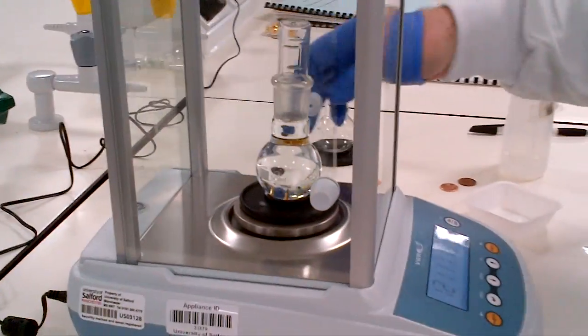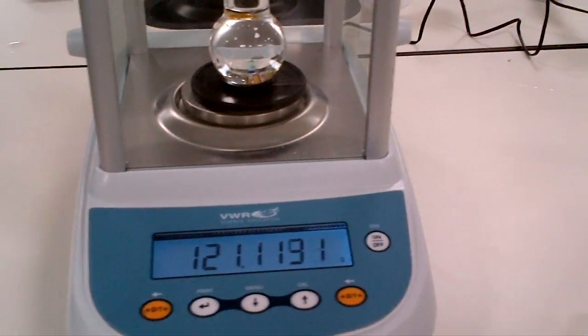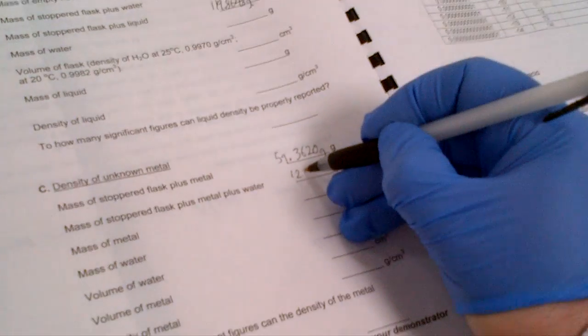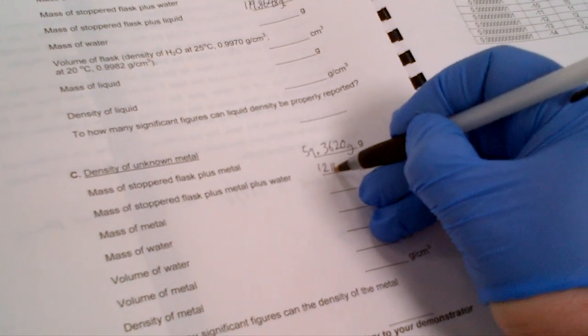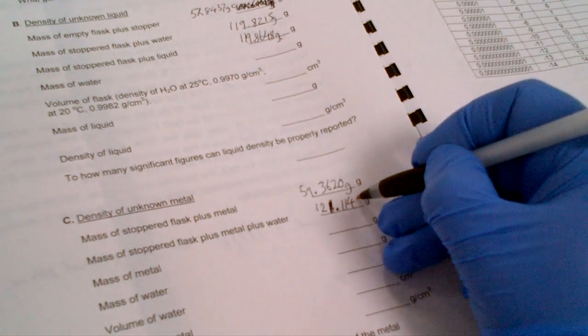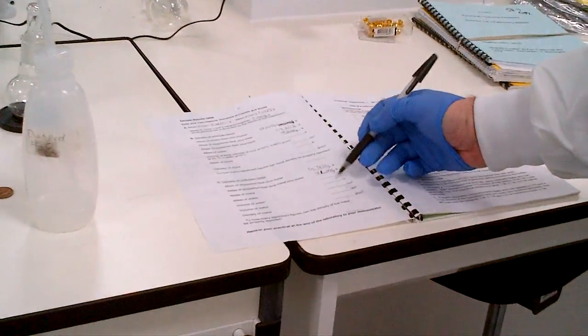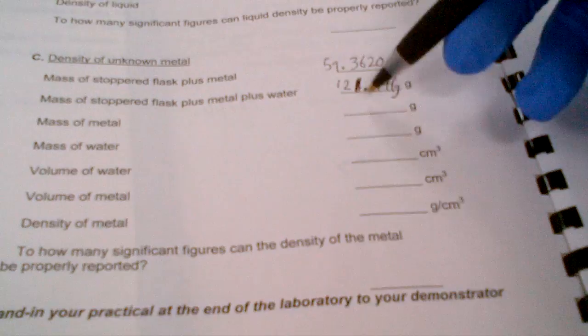I'm going to place it back onto that. So we've now got a mass of 121.1141 grams. So this part you can fill in on your own. Again, further advice might be available later on about how to do this.